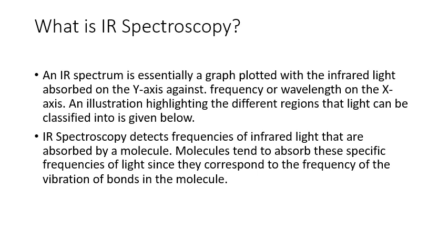Now, the first question is, what is IR spectroscopy? An IR spectrum is essentially a graph plotted between infrared light absorbed on the y-axis against frequency or wavelength on the x-axis. In the next slide, I will show how different regions can be classified on this spectrum.